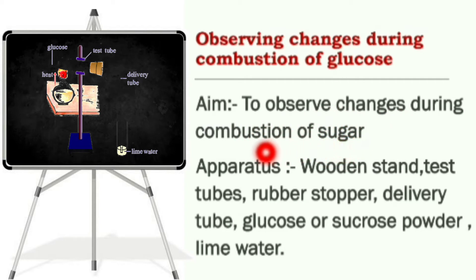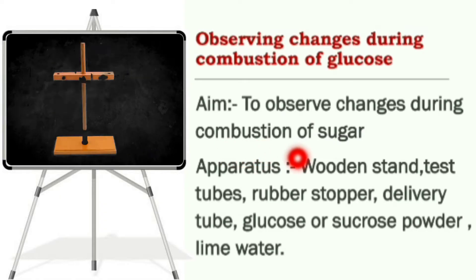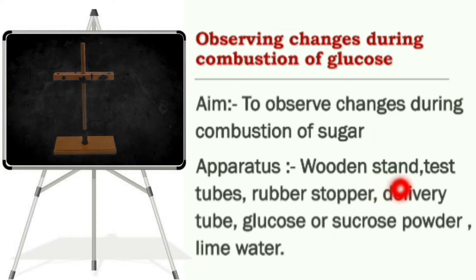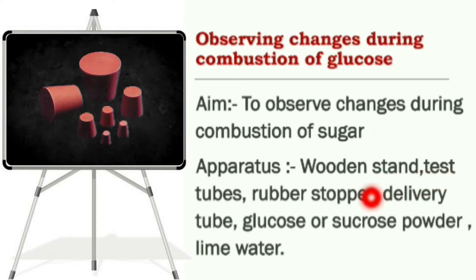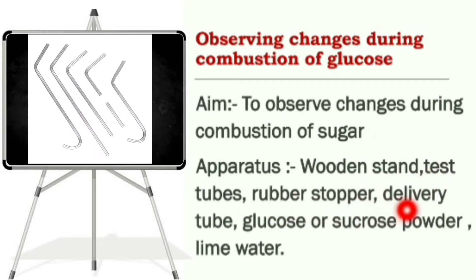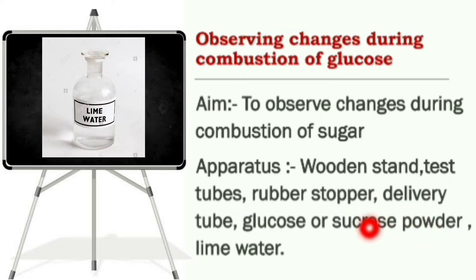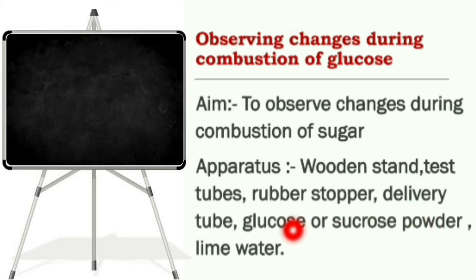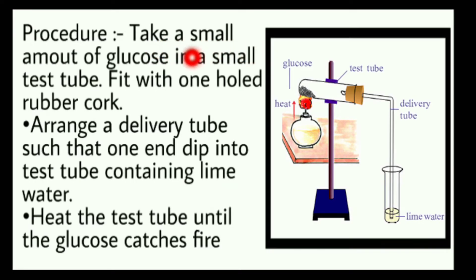When the sugar undergoes combustion it will change, so we observe it. Apparatus: wooden stand, test tube, rubber stopper, delivery tube, glucose powder, lime water. We take a small amount of glucose powder in a small test tube and fit one rubber cork.